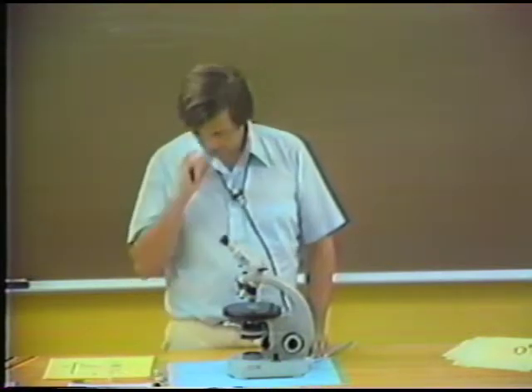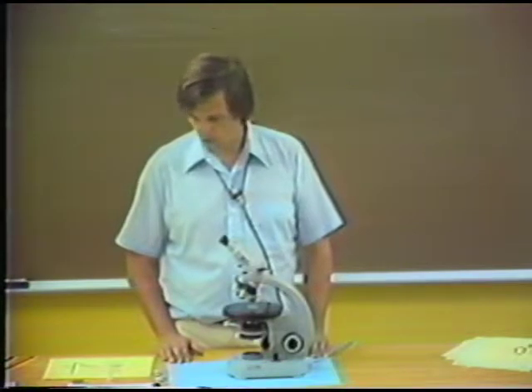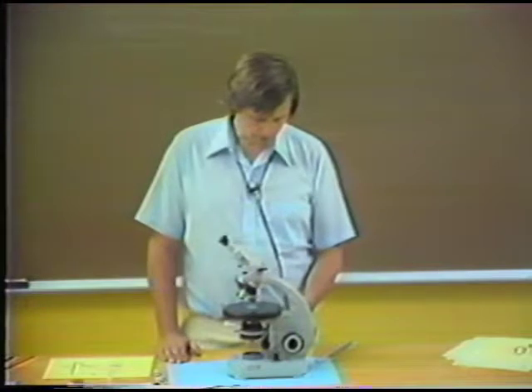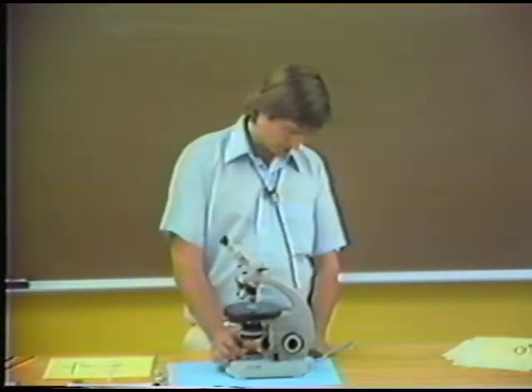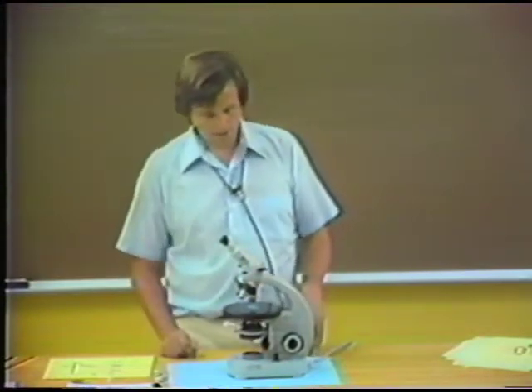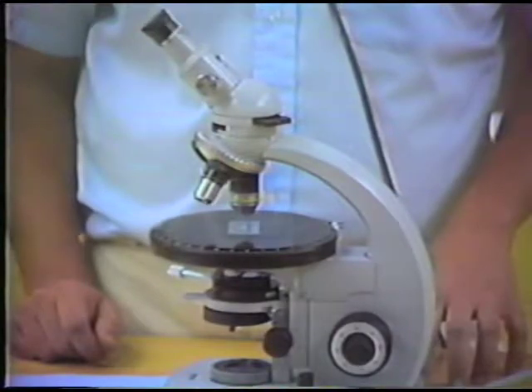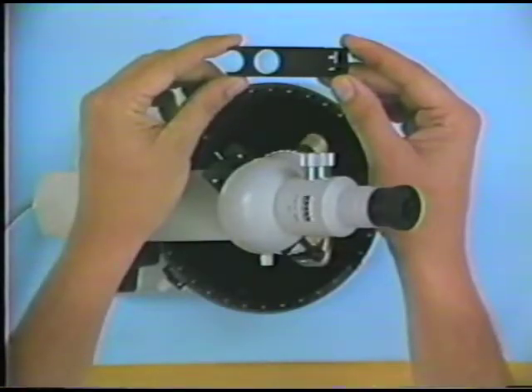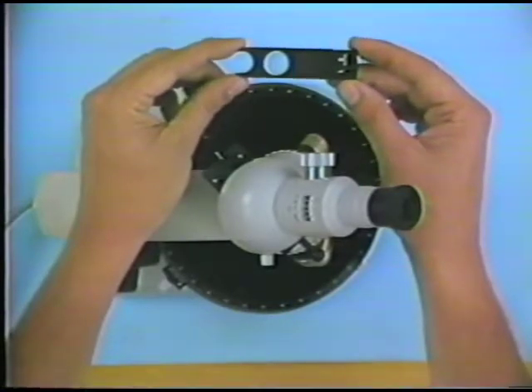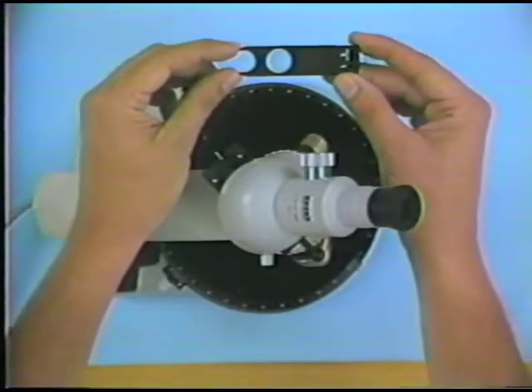We're looking at this mineral in a 1.576 oil. Now, what we'll do in this particular test is I'm going to open the diaphragm again here to increase our light, and I'm going to use the accessory slot and an accessory plate. So I'm going to use this accessory plate. It doesn't matter which accessory plate you use. You can use your gypsum or your mica plate.